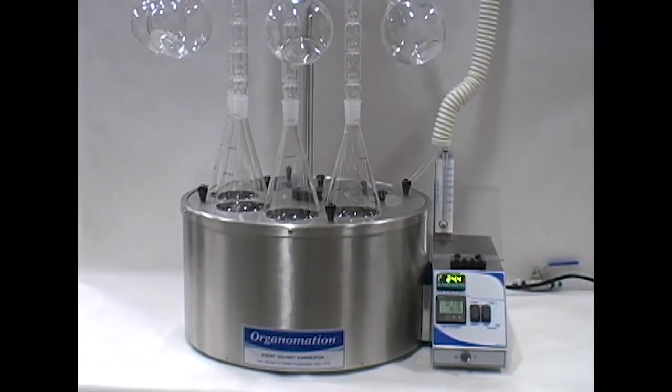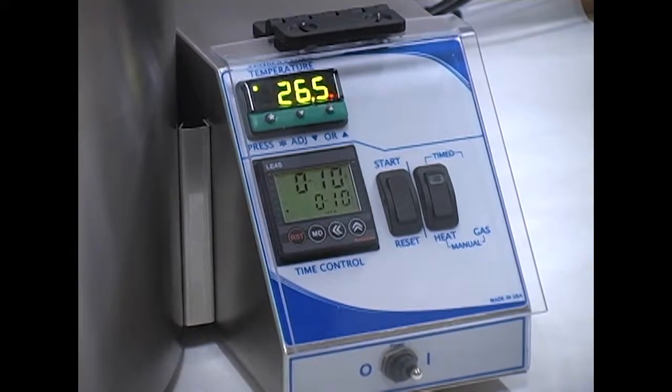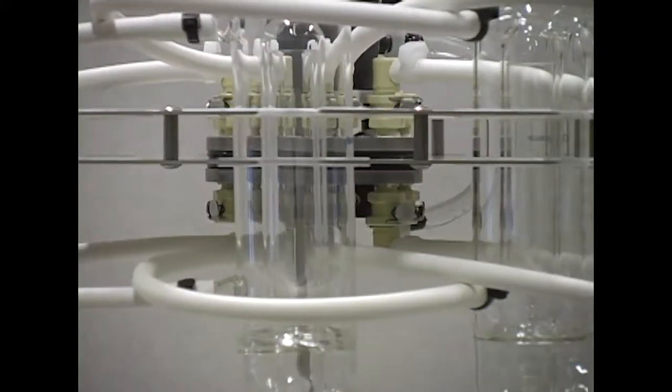This instrument comes with a heated water bath, digital side control box, cover discs for unused sample positions, condenser holder, and rotating water manifold.